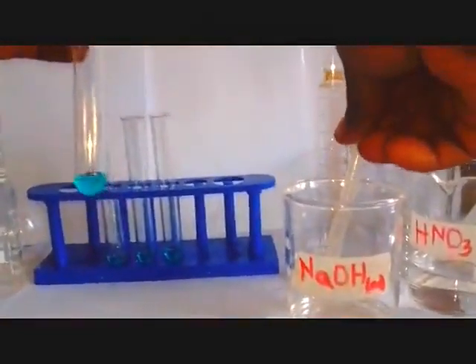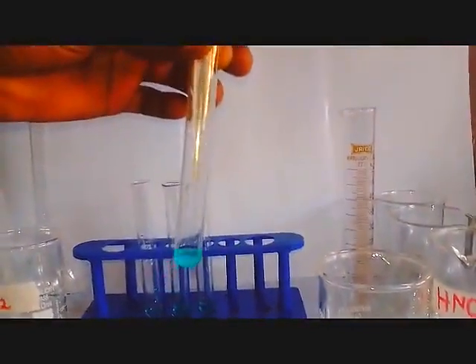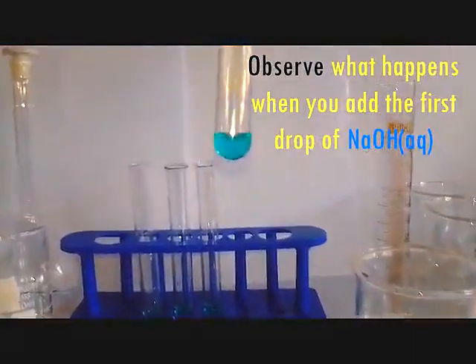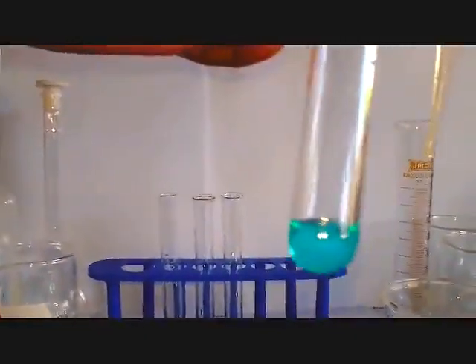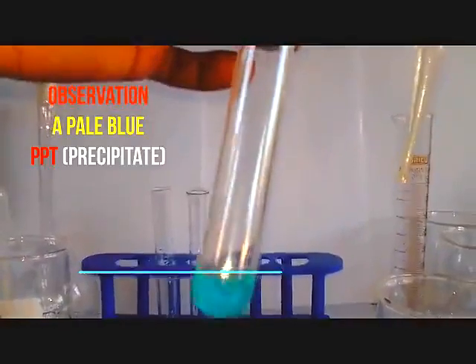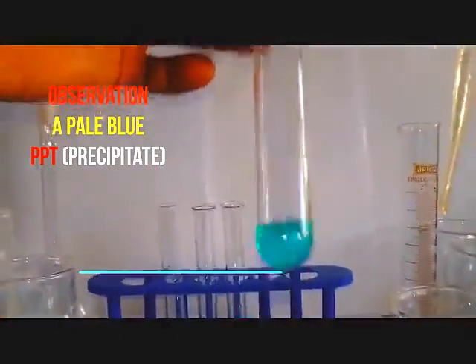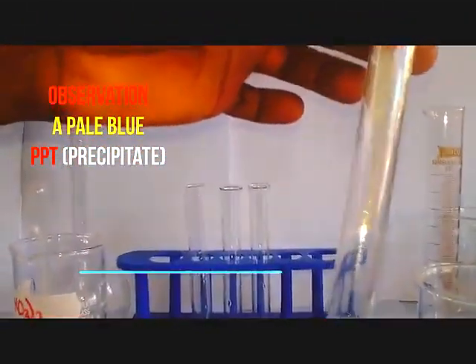Then as we are adding the reagent, in this case the solution, you bring it here. As we are adding, you should be able to observe what happens when you add the first drop. Drop 1, you can see there is a solid which is formed, and practically we call it a precipitate, or you can call it a PPT. In this case it is blue in color. So this is the first drop. We are going to add drop by drop until in excess.